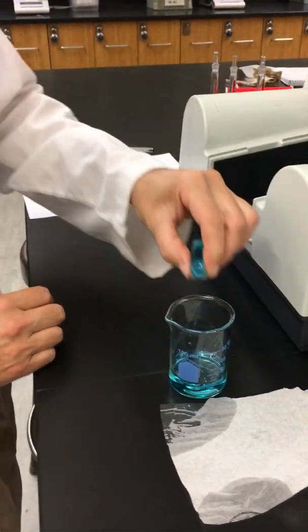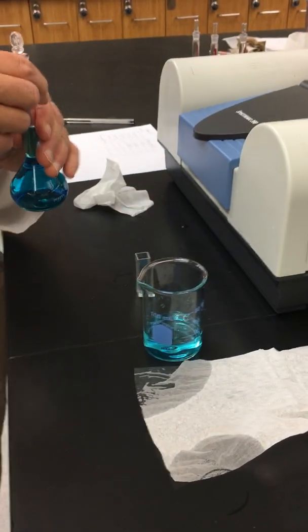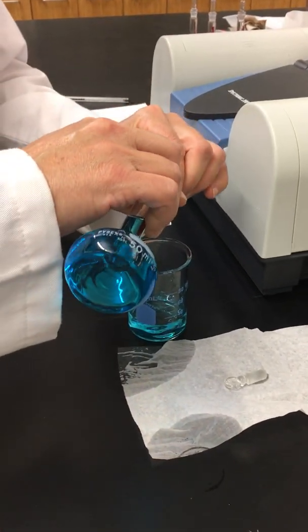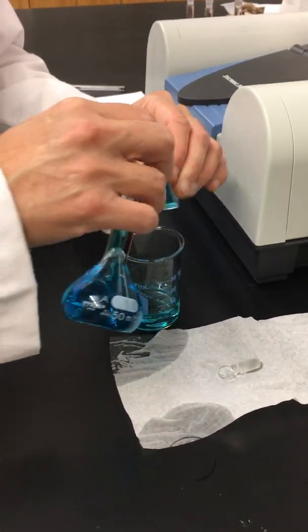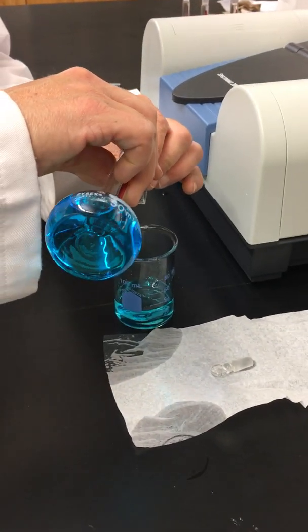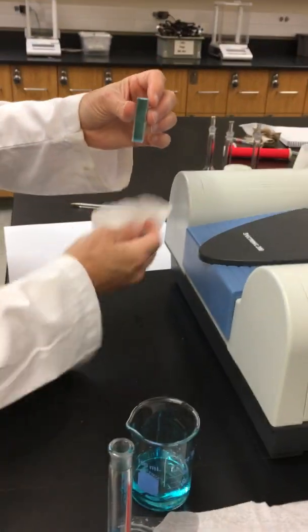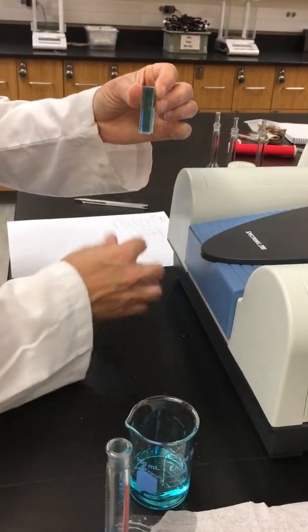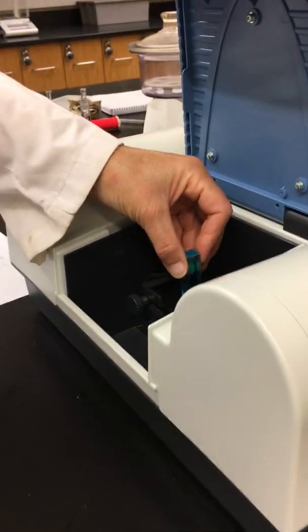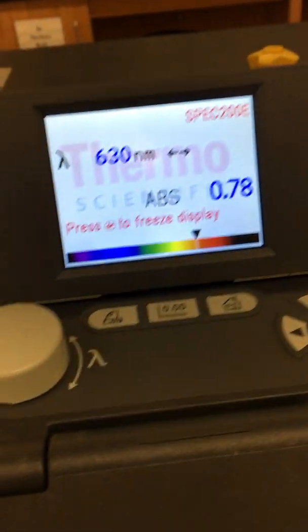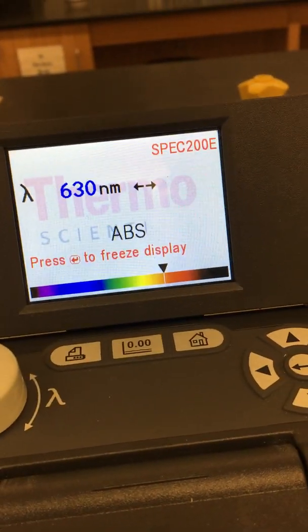We'll pour out solution number three. Now we're ready to do our solution number four, the same procedure. We'll rinse our cuvette with our solution, wipe it down with our Kimwipe, place it in our spectrometer. Now we'll get the absorbance of our solution number four, which is 0.78.